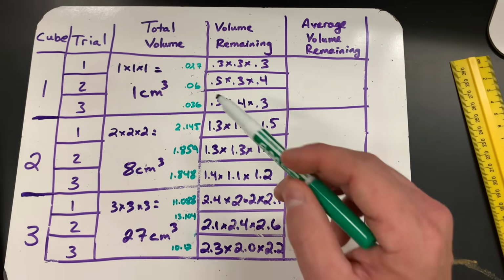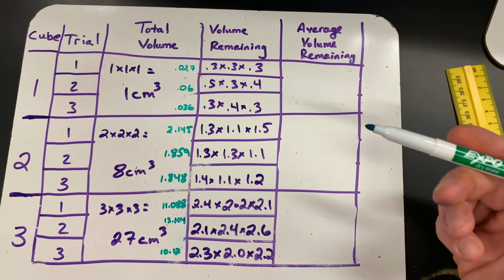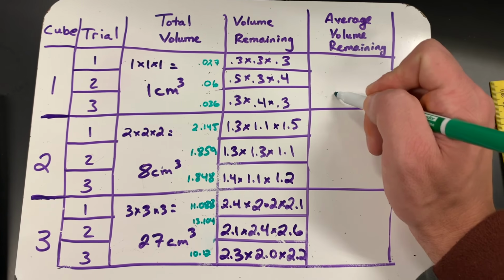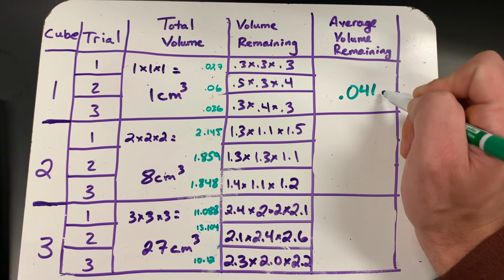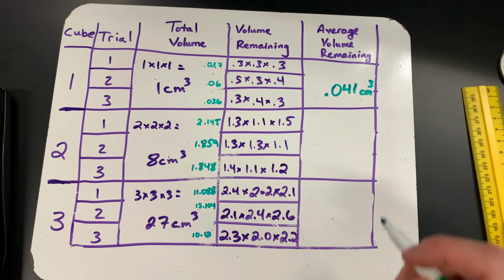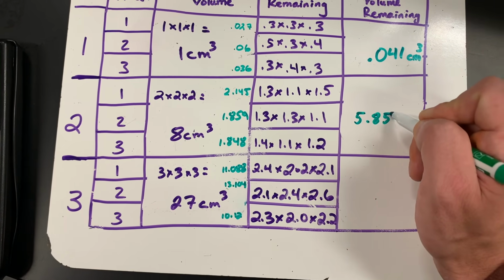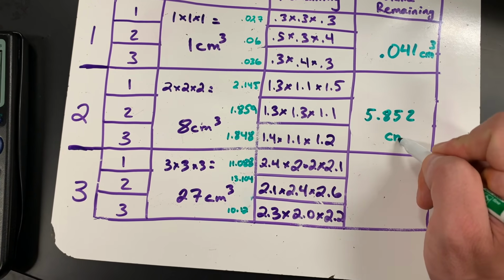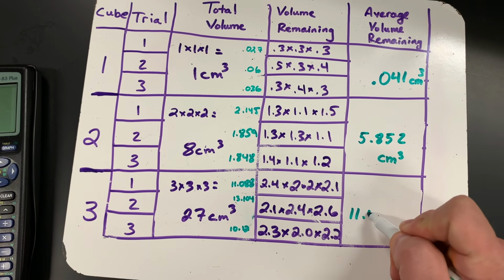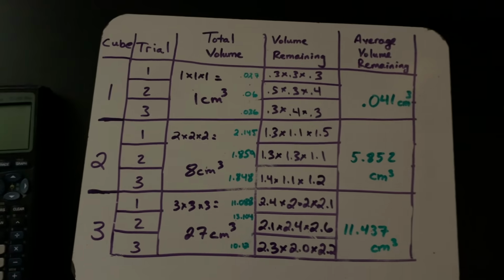So what I did after this is I added our 3 trials, our 3 volumes, up together and then took an average of it. So add them up, divide by 3. For our 1 centimeter cube block, I get 0.041 centimeters cubed for our volume. The second one, add them up, divide by 3. I got 5.852, and again, centimeters cubed. And then the last one, I got 11.437 centimeters cubed, as the lights go out.